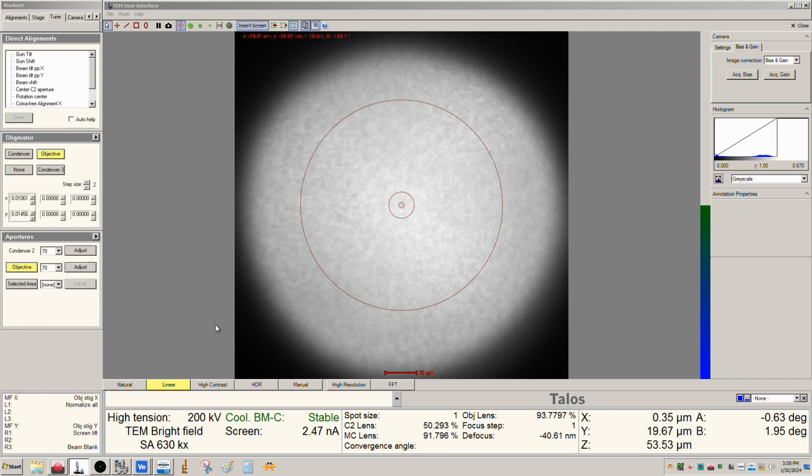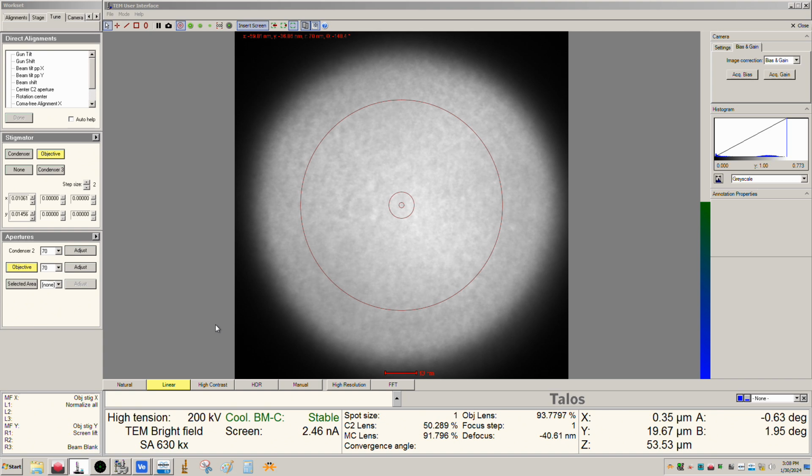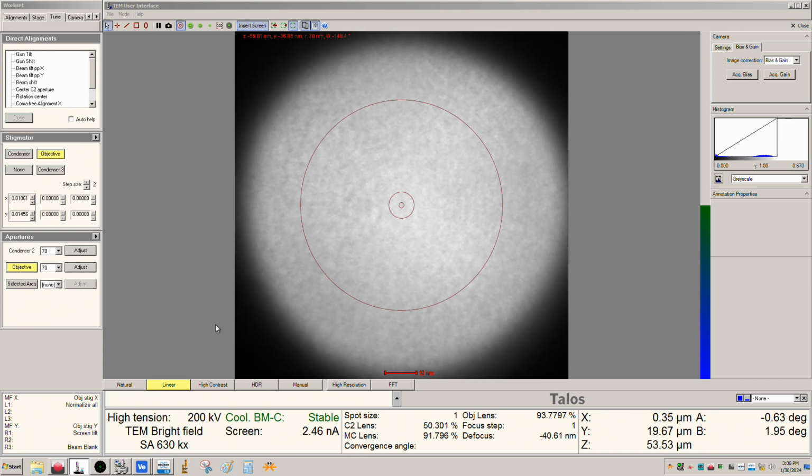Again, I would never do this on the camera itself, so I'm just going to do it here, but we're just going to accelerate this a little bit here, right? So now we can start to see what's going on here. And once we've cooked things a little, I'll spread the beam back out and we'll take a look at our handiwork here. Okay, let me spread it back out.